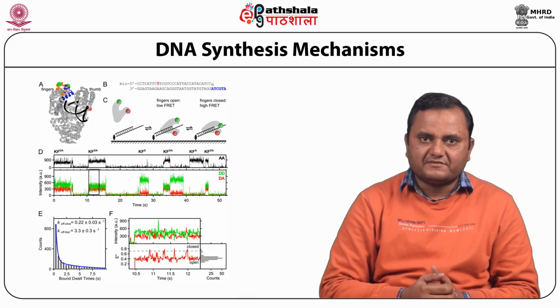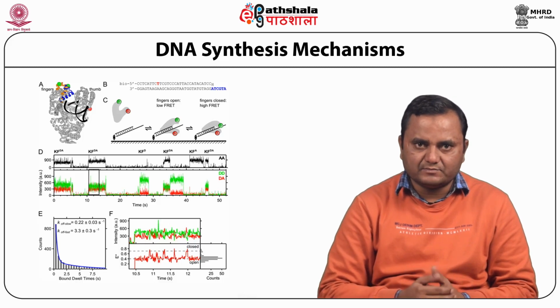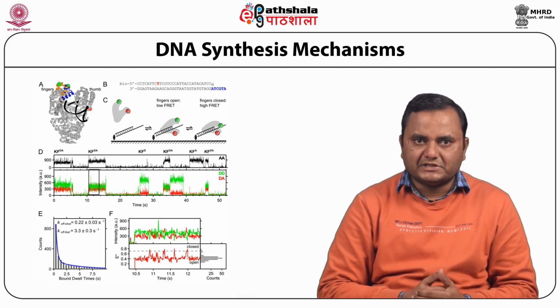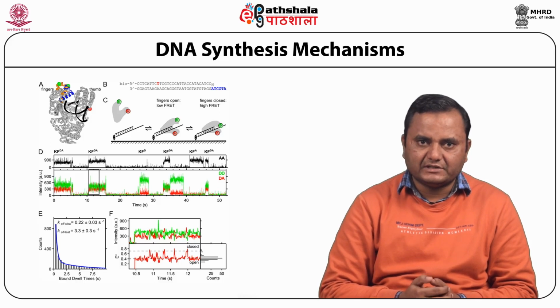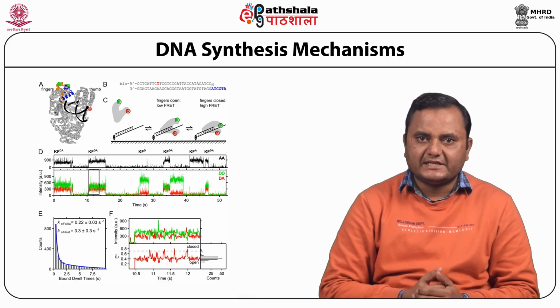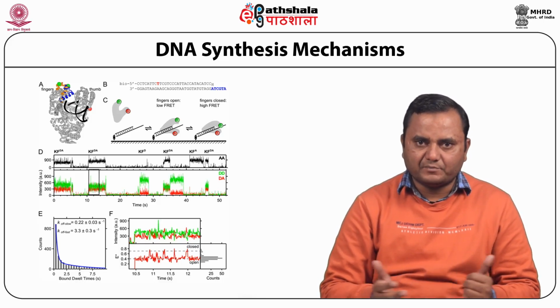And C represents, after photobleaching the red fluorophore attached to DNA, transient binding of KF molecules to DNA is monitored and the conformational energy with KF is characterized using an internal FRET pair. And D represents fluorescence emission as a function of time of the localization of DNA molecules. E represents the KF-DNA complex with dwell time reveals bimodal dissociation kinetics, and F expands a binding event in D with the fluorescence trace in the upper panel and the corresponding FRET proximity ratio.